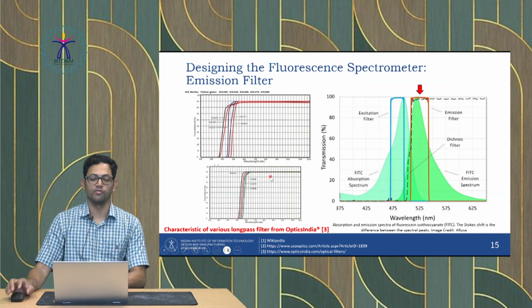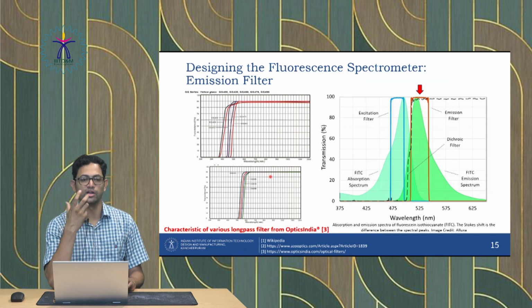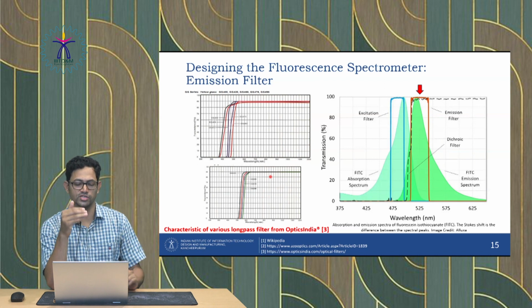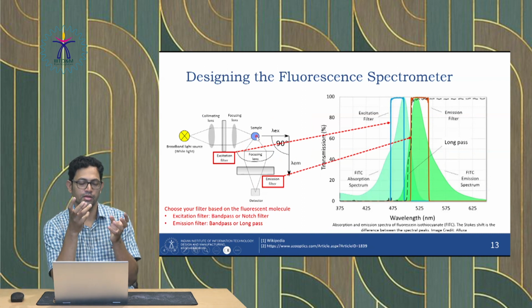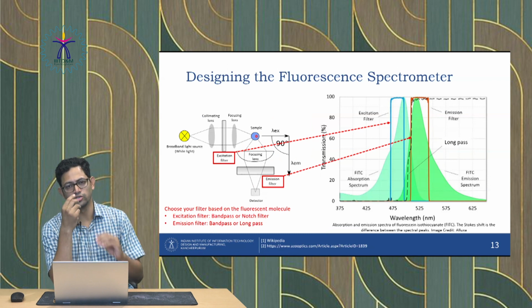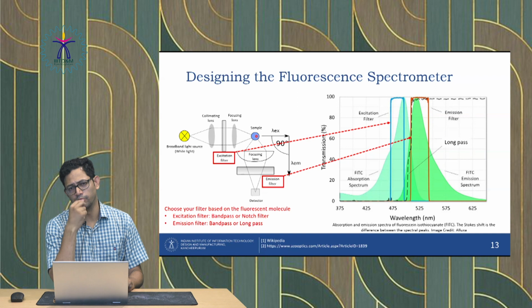So this is the basic part of the discussion of fluorescence spectroscopy. In the next session, we will talk about how to set up a fluorescence imaging tool for oral cancer imaging. Because it's oral cancer imaging, we cannot have a transmission-based setup. What we saw some time back was a cuvette example, where we put the sample, analyte, and fluorescence dye within a cuvette and shine the light on it. But in the case of oral cancer, we apply the dye using a cotton pad, and we keep it inside the mouth.